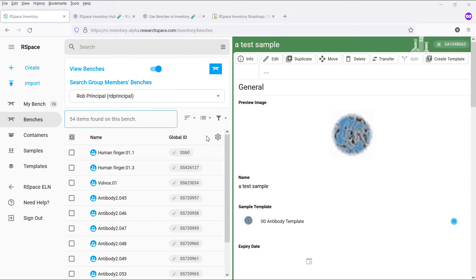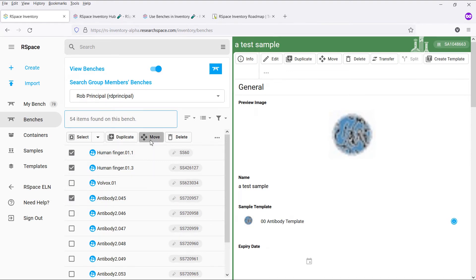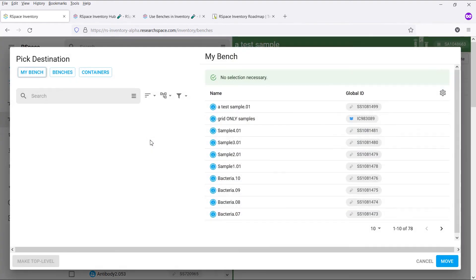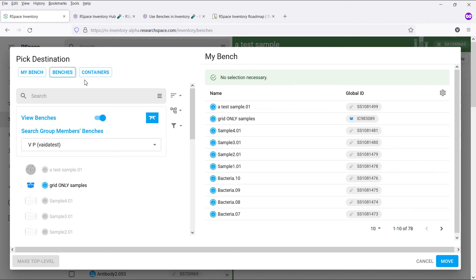Regarding moving items to and from benches, this works exactly the same way as moving items between containers. Just select the relevant items, then click on move. You can then choose whether you'd like to move these items to your bench, or into a container that's on your bench, to another user's bench, or into a container in the container hierarchy.